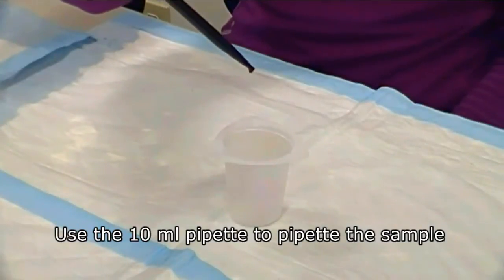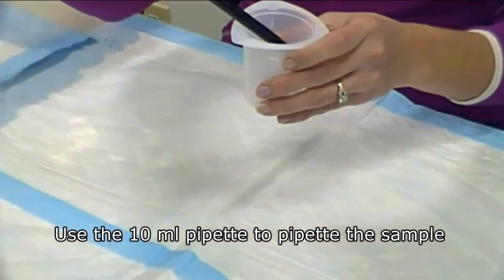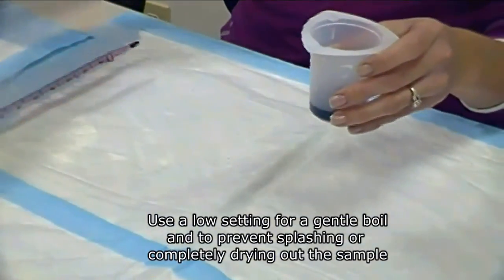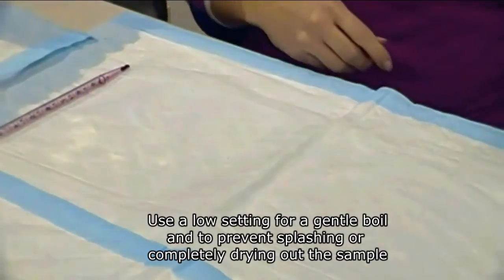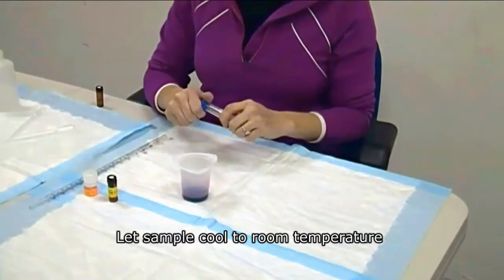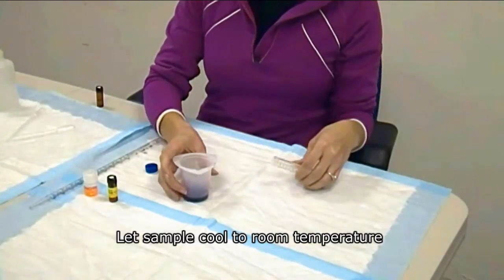I'm taking my 10 ml wine sample and placing it into my 100 ml plastic beaker. Now I'm going to put it in the microwave for about 90 seconds on a low to medium power so it gently boils. We have just finished heating the 10 ml wine sample for 90 seconds on a medium power.